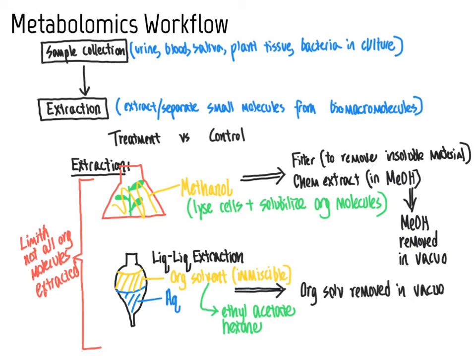And if you're not sure at all, another thing that is sometimes done is that people will run multiple types of chemical extractions and conduct metabolomics analyses on all of those chemical extracts. That can get pretty laborious though. So let's go on to the next step of the metabolomics workflow here.